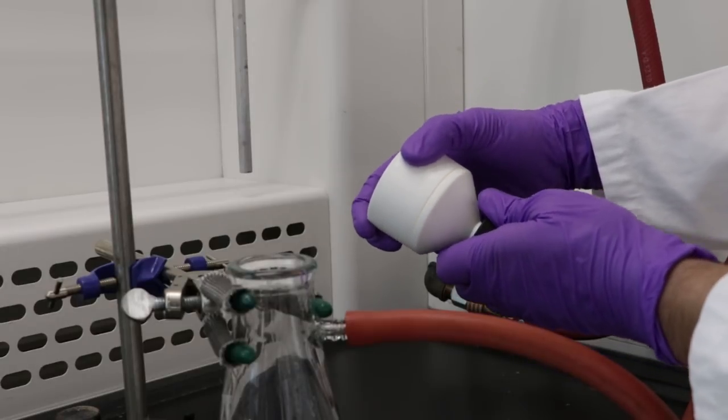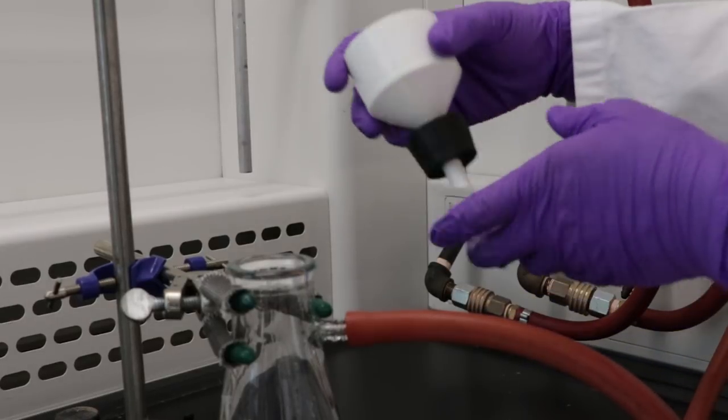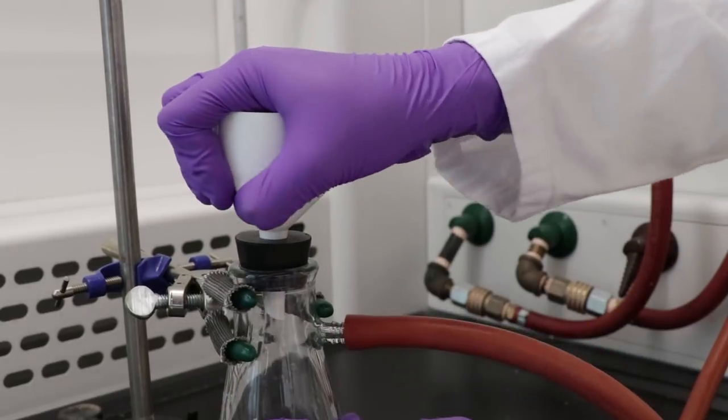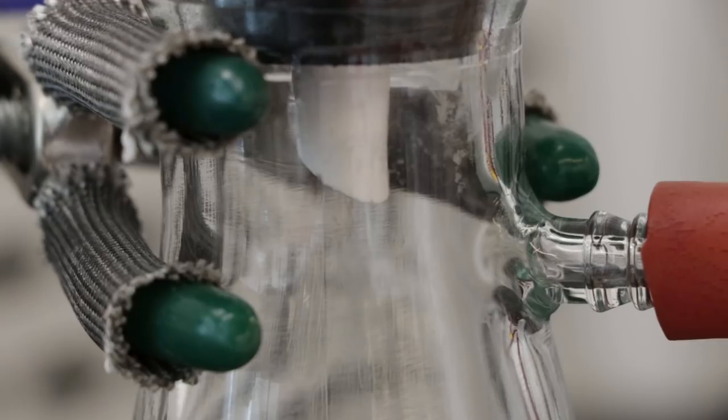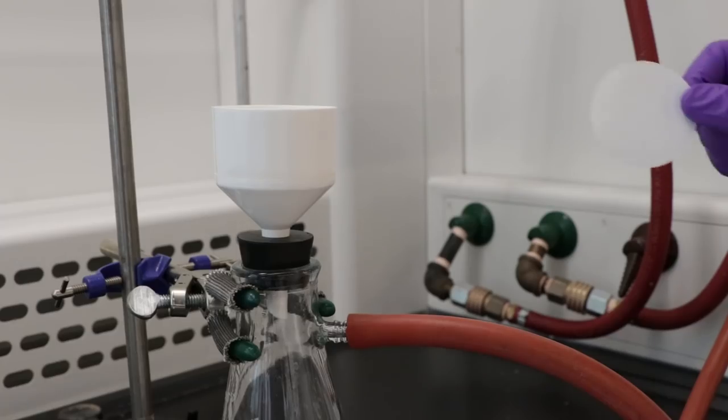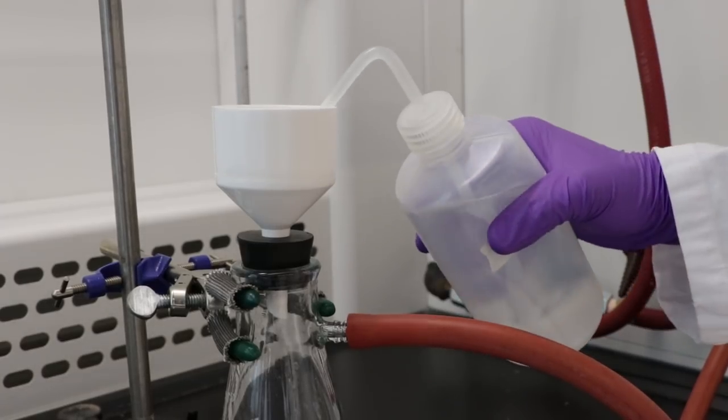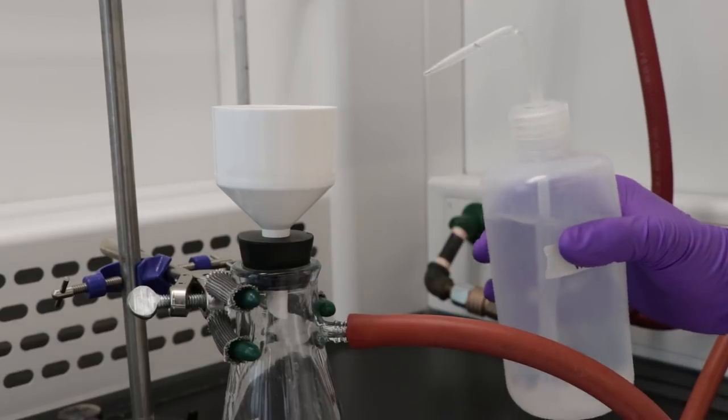Assemble the Buchner funnel. Secure to the top of the vacuum flask tightly. Make sure the funnel opening is pointing away from the vacuum. Place the filter paper in the top of the Buchner funnel and wet the edges to create a seal.